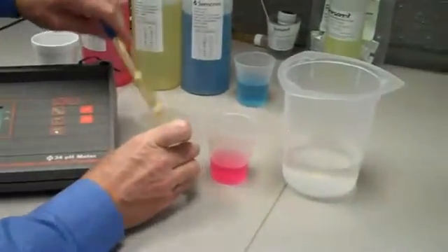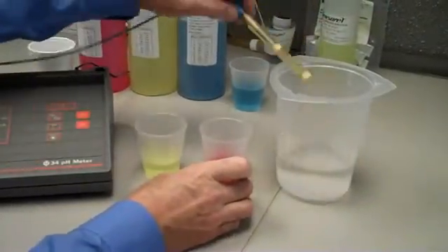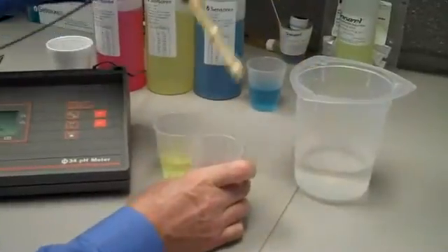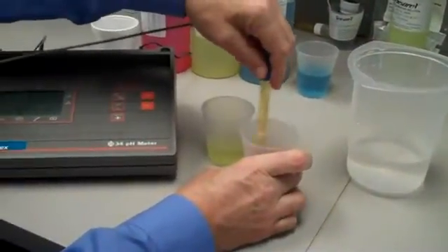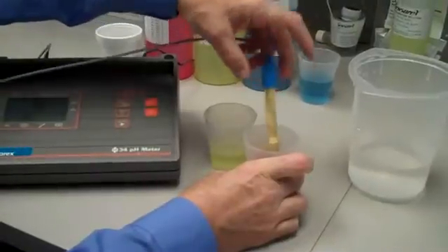We can remove the electrode from buffer 7, put it into rinse water, and then place the pH electrode into a buffer of 4, stirring vigorously for a few seconds.